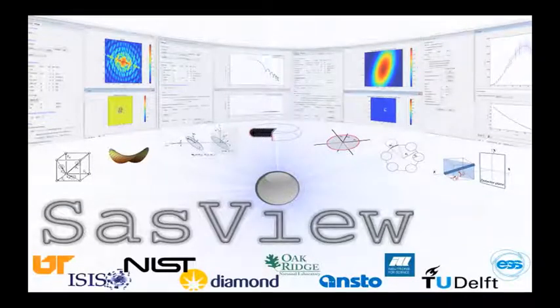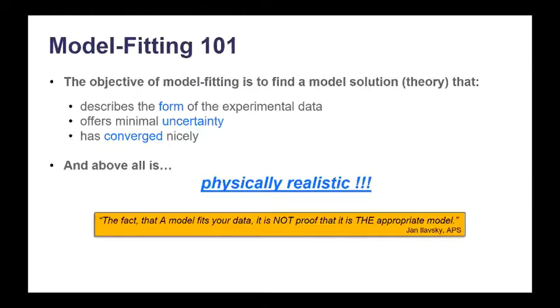Before I actually demonstrate SasView, I thought it might be helpful to say something about model fitting, which is, after all, the core function of the program, particularly for those of you that are perhaps new to data analysis. So I've put a few slides together I've called Model Fitting 101. In its simplest possible terms, model fitting is about finding a physically realistic model that accurately describes the data with a physically realistic set of parameters.